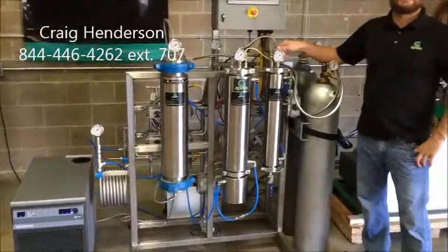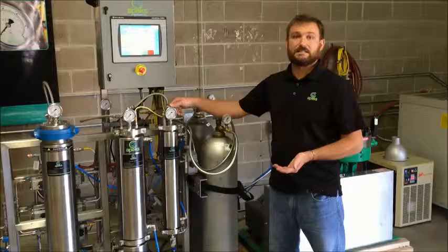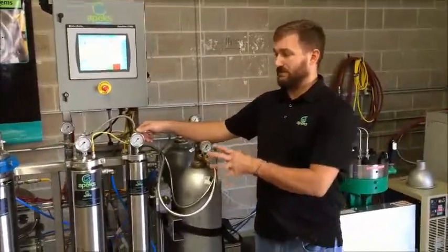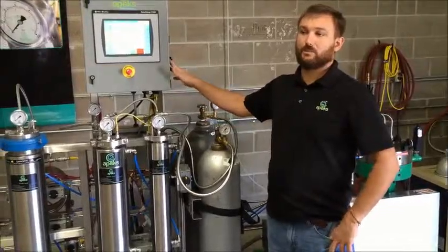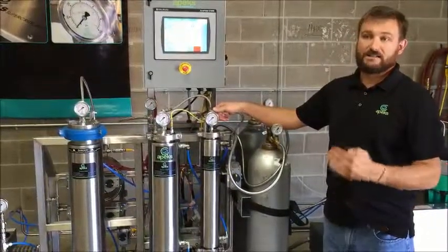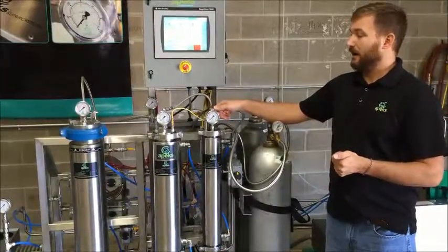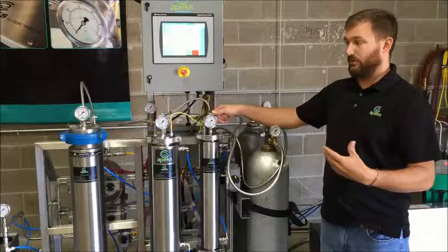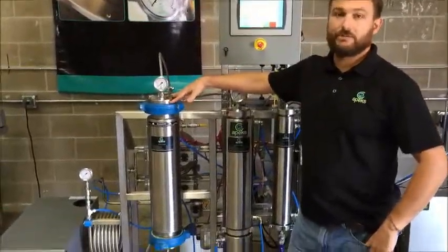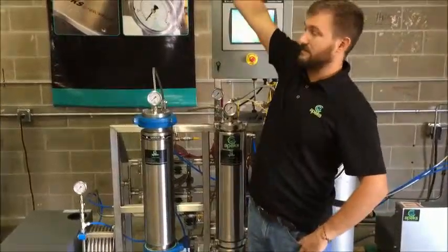I want to discuss a little bit about the 2005 LD versus our desktop unit versus our 5,000 PSI series. The 2,000 series refers to the max pressure that the system will run — this system will run between 900 and 1,900 PSI, whereas our 5,000 series will run between 900 and 4,900 PSI. The 5 LD versus 20 LD refers to the size of the extraction vessel — the amount of material the machine can hold. This is a 5-liter vessel and we make 20-liter vessels as well.